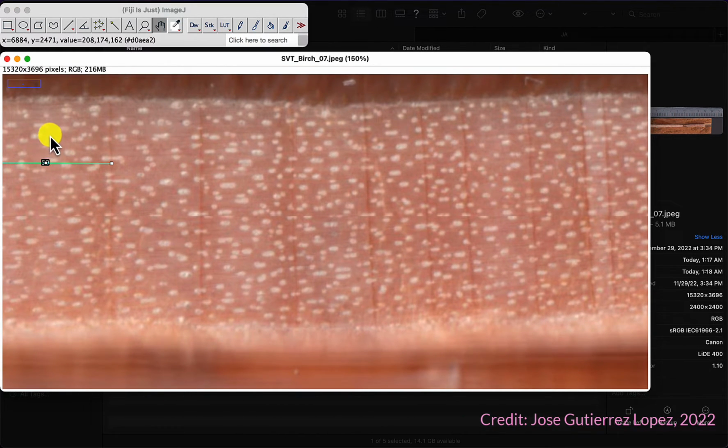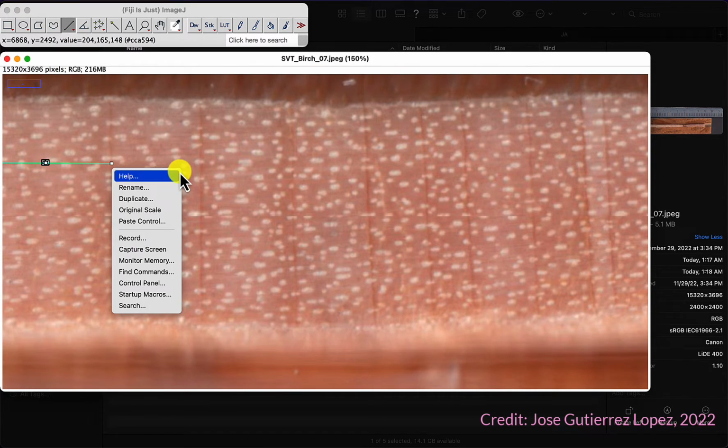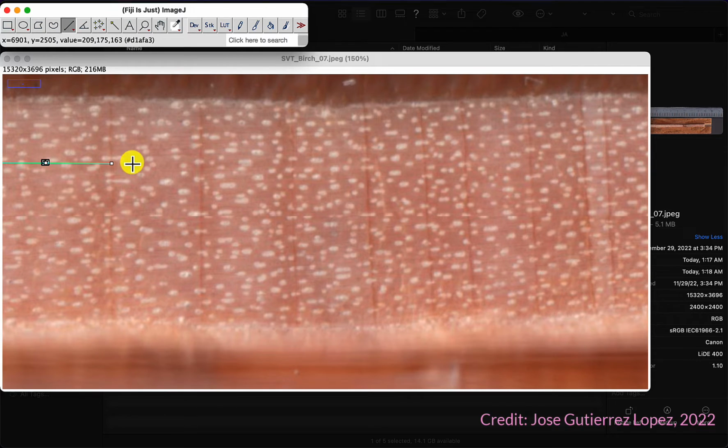Yep, I guess it's an old tree. Nope. You saw how tiny the sample was, right? So these are boreal trees. They don't grow as much. They grow very little every year.